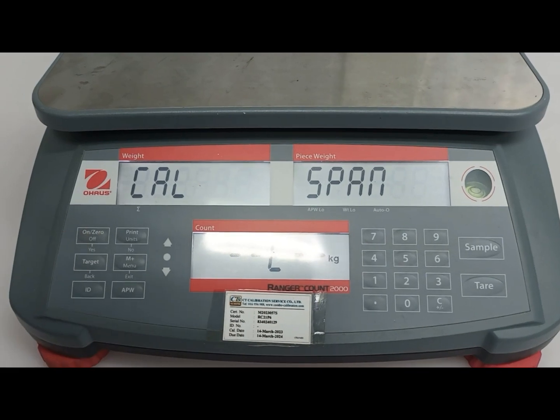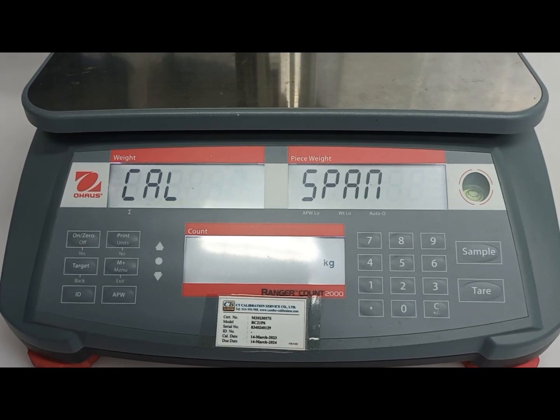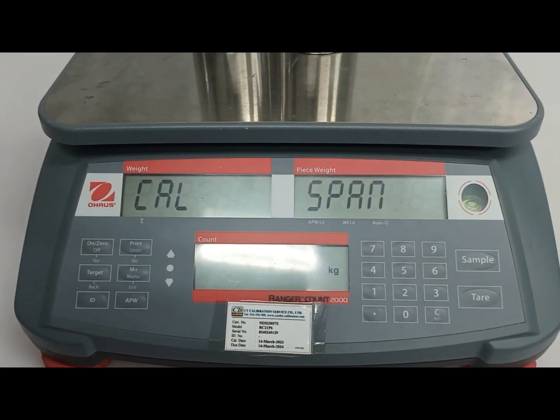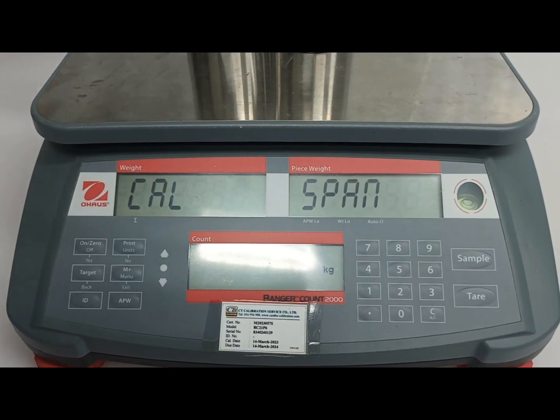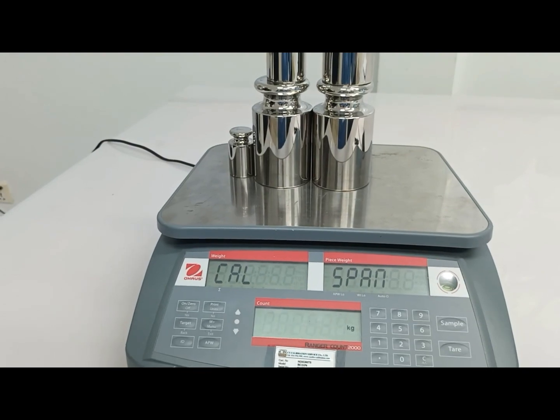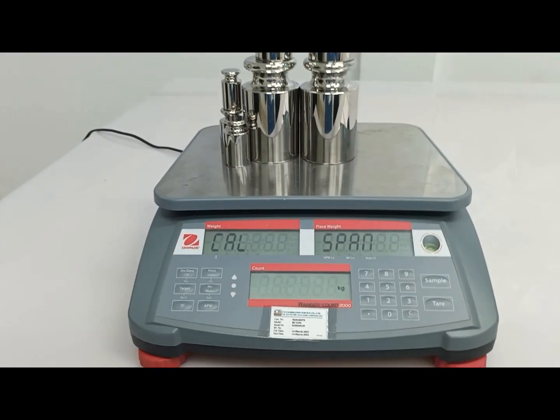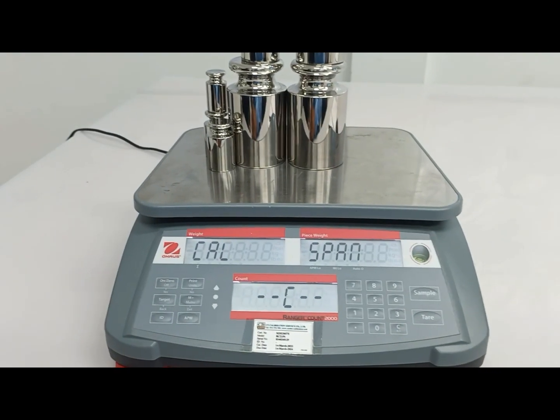Okay, I enter. 6 kg. I will put the standard on the pan — 6 kg. Yes, enter.